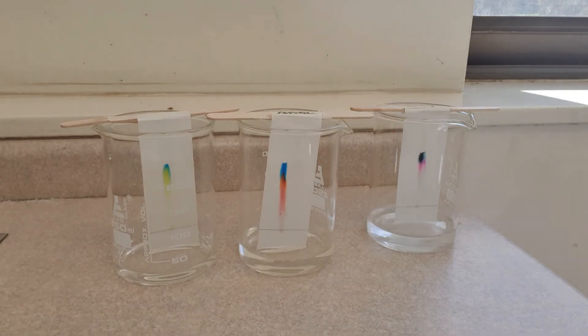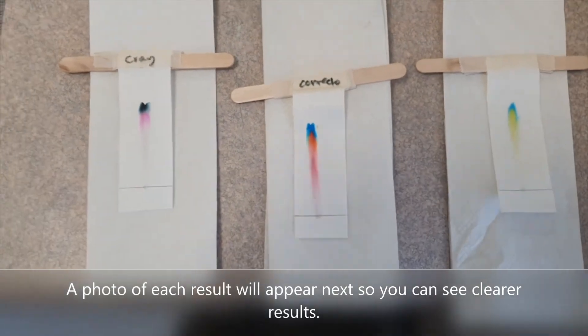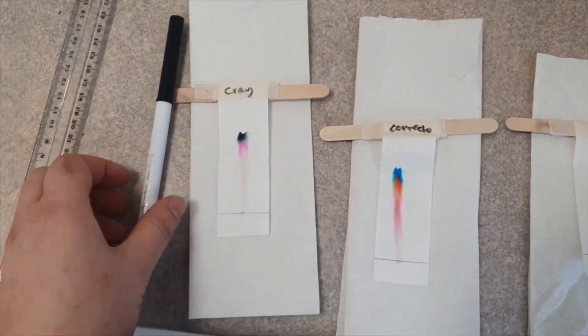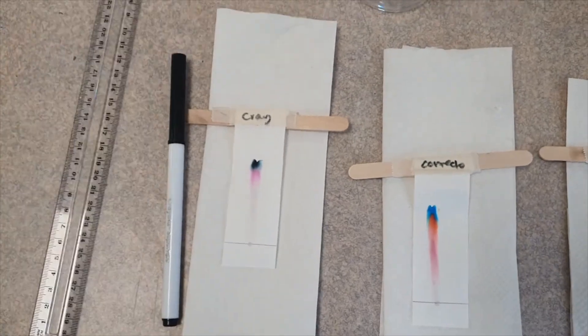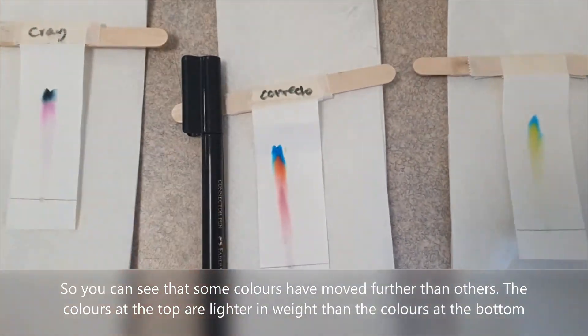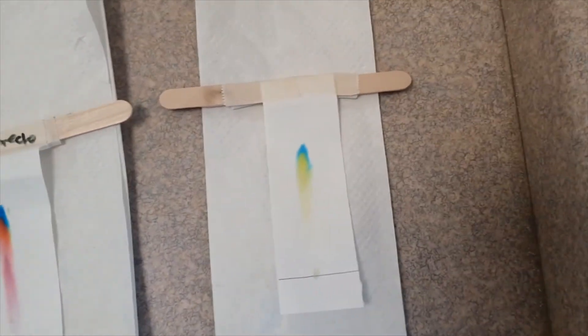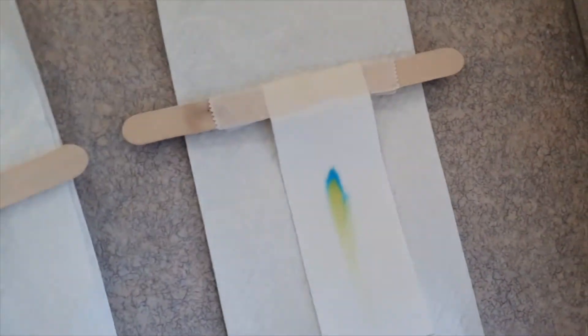We'll be right back. Alrighty! So here we have the Crayola texta and the connector pen — look at that — and the green food dye.